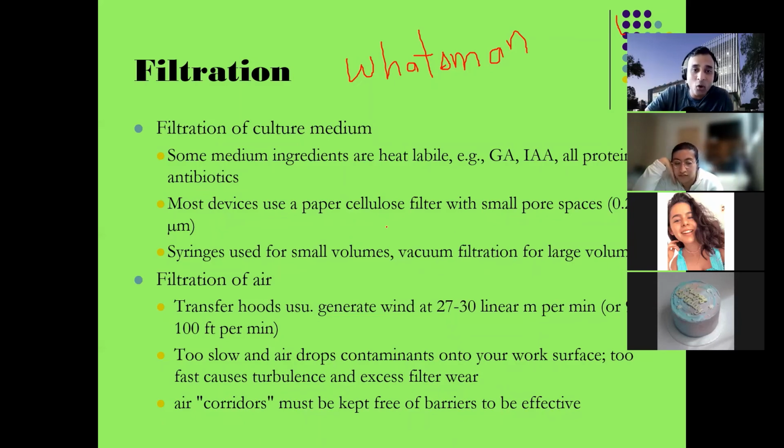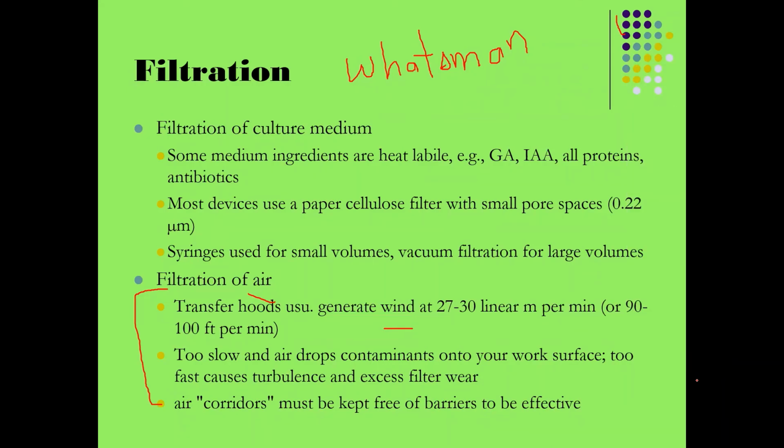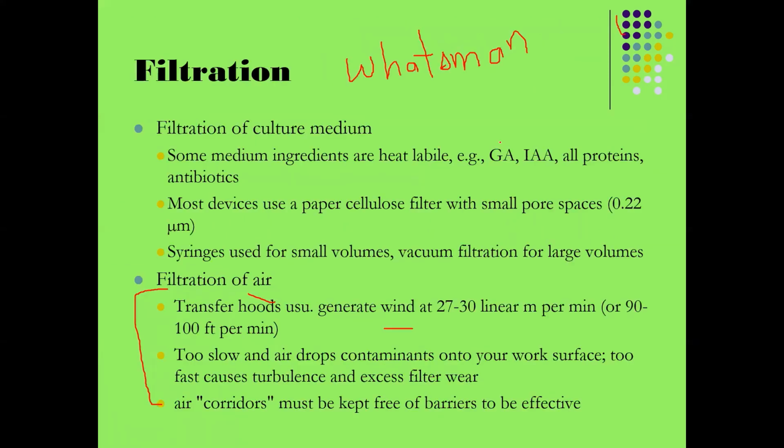Now filtration in the hood, laminar airflow. Everybody knows that, right? What is the principle of laminar airflow? Anybody who can tell me? Campana de flujo laminar. Who can tell me the principle? How does it work? Yes, Amelia. It's literally like a box filtering with a filter called HEPA, I think. It's a constant airflow that is sterilizing or filtering the contaminants when you put your equipment inside.